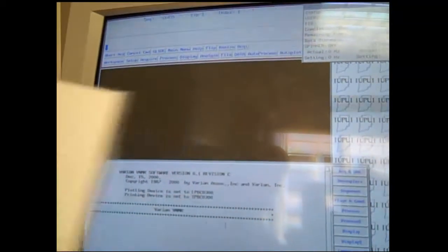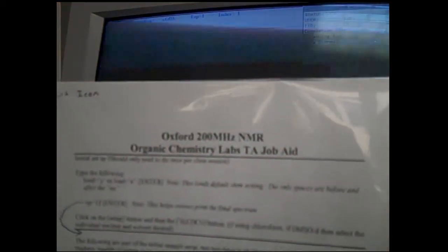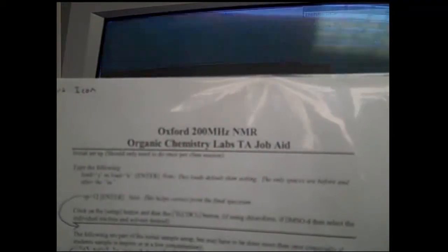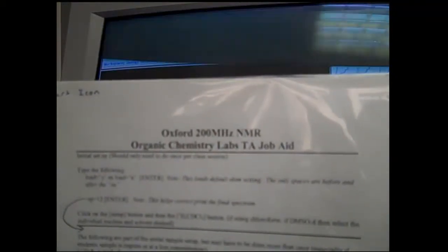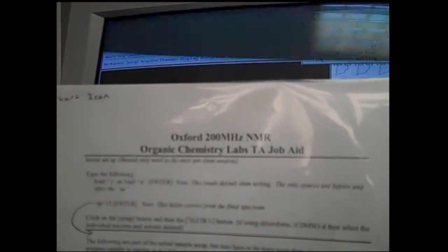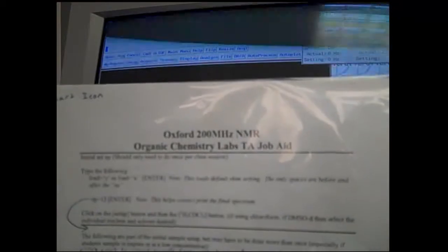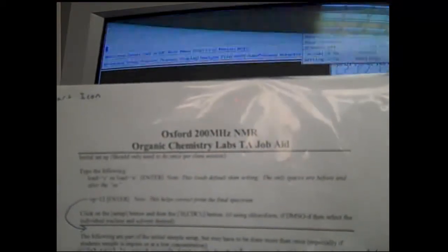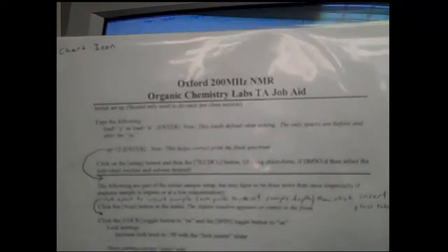This is the main display screen for the NMR software. As you're going through this process, there will be a sheet of paper that is a job aid for running through the NMR. Note that you'll always have this sheet that goes through step-by-step instructions of how to run the NMR.